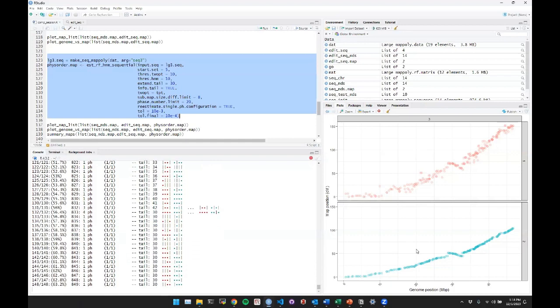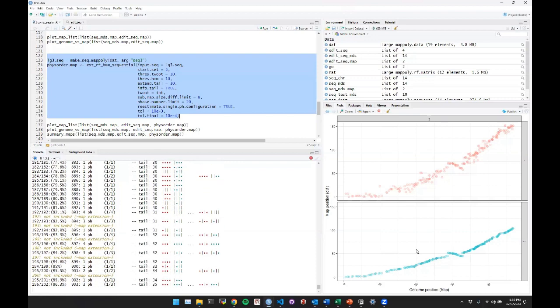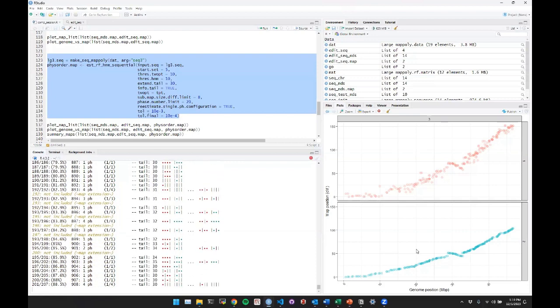It's either because the structure of our genome and the reference genome are not the same, or there are some mistakes along the way. And what we want to do with these physical comparisons is try to improve the maps that we have, and we cannot do that across segments where there are clear inversions, either because of our germplasm or because of the reference. And what they're trying to do with these new improvements in MAPpoly is to be able to take advantage of that knowledge and correct for those, to redo the maps that are based again on segregation data nonetheless.